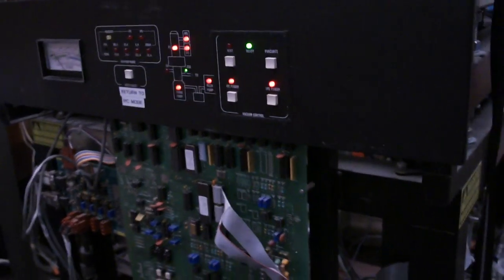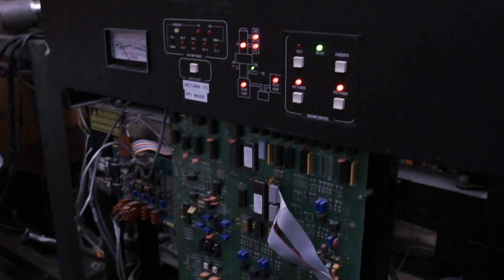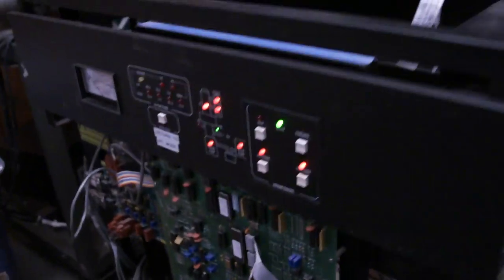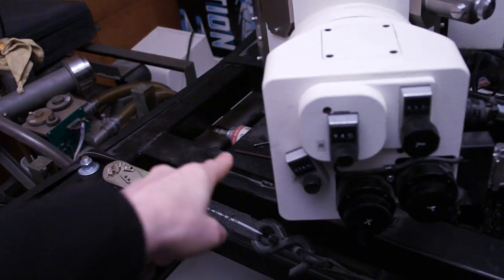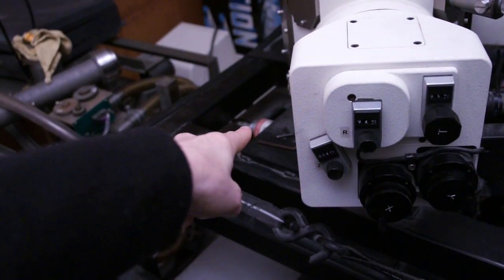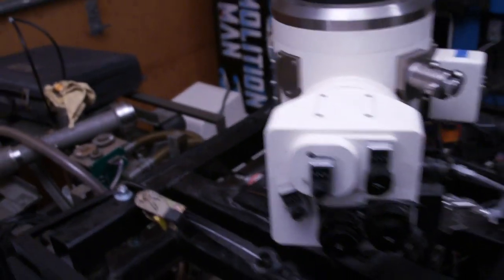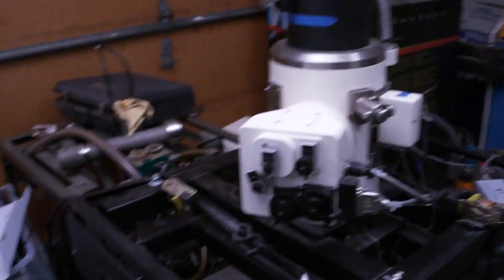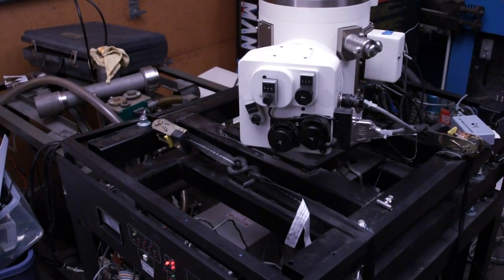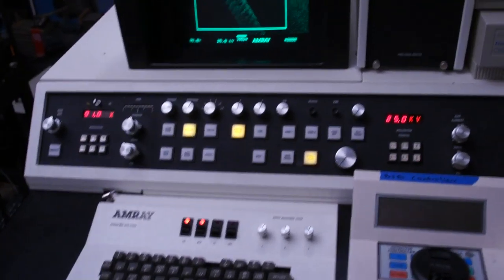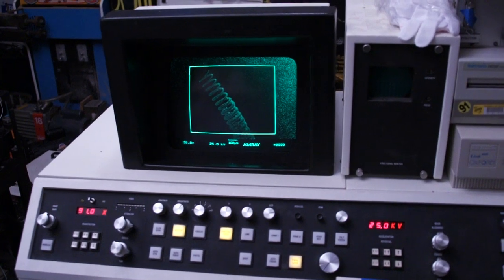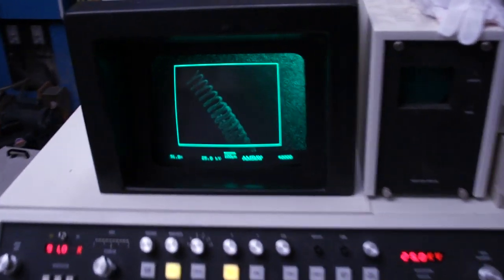Once it gets to a low enough vacuum, then it switches over to another vacuum gauge. You can actually see it here. This is like a triode vacuum tube, and you can use that to measure down to 10 to the minus 6 torr. And then once you reach the proper pressures, it will indicate to open the gate valve, and then you can start imaging.